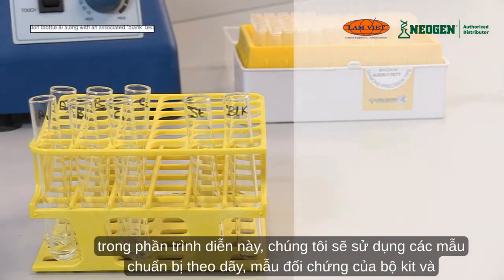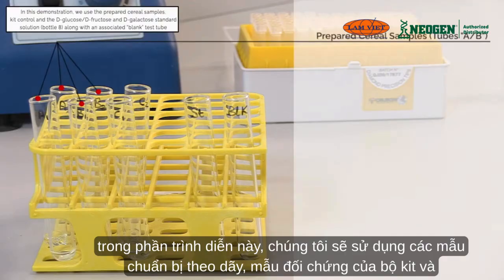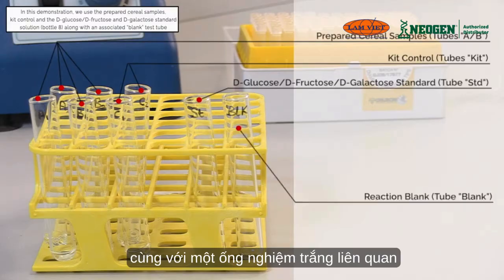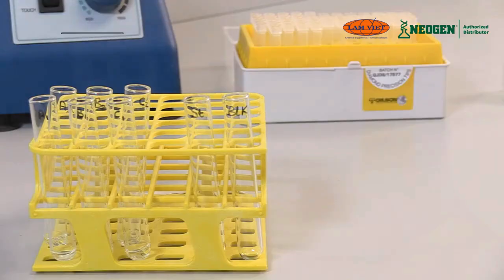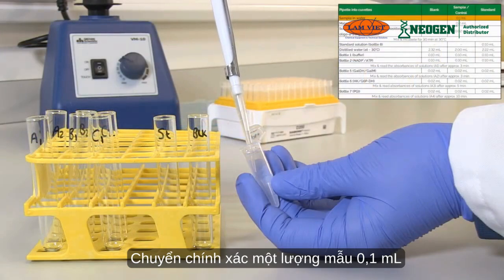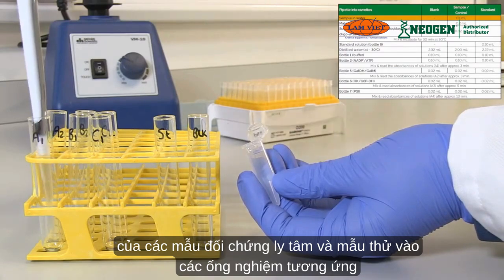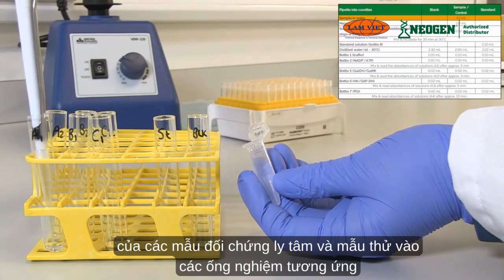In this demonstration, we will use the prepared cereal samples, kit control, and the D-glucose, D-fructose and D-galactose standard solution, bottle 8, along with an associated blank test tube. Accurately transfer a 0.1 ml aliquot of the centrifuged controls and samples into their corresponding test tubes.